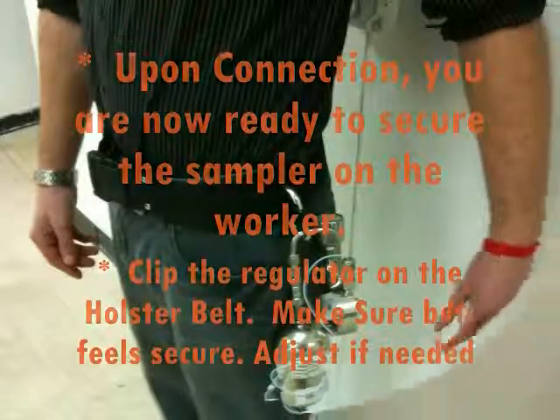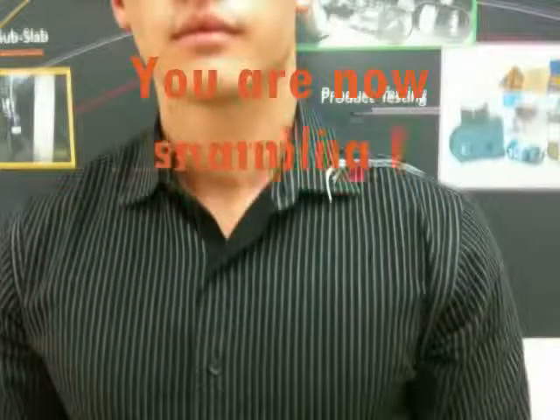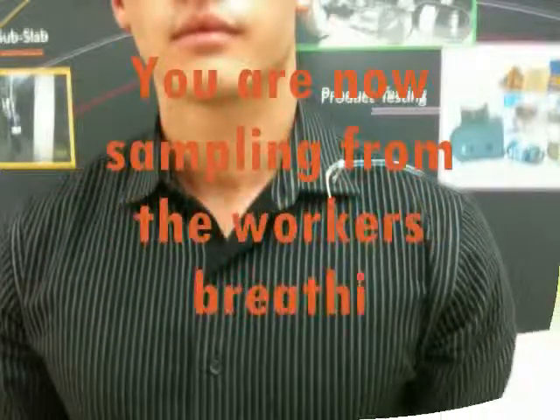Secure the mini-can sampler to the holster belt. Check if the sampler is secure and adjust if needed. Now pull the tube and pin attached to the regulator up and around the worker's back. Pin the tube to the collar. You are now sampling in the breathing zone.